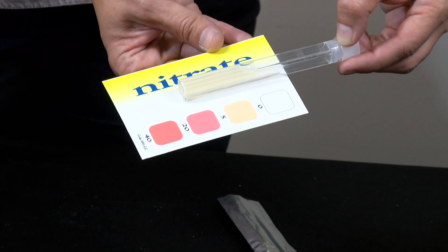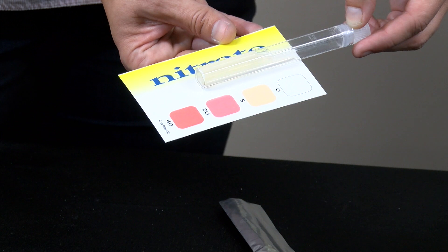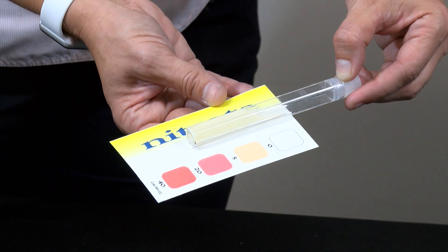Take it out of the sleeve, then compare that sample with the nitrate color card. In this instance our color is not completely white — it is sort of in between — so our sample is probably around five parts per million.